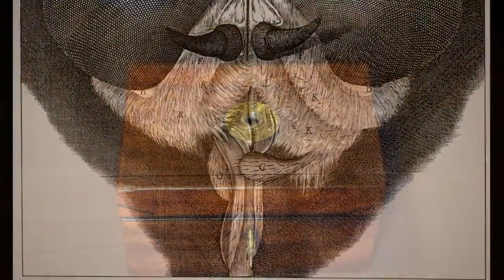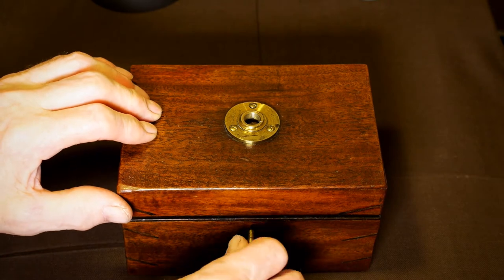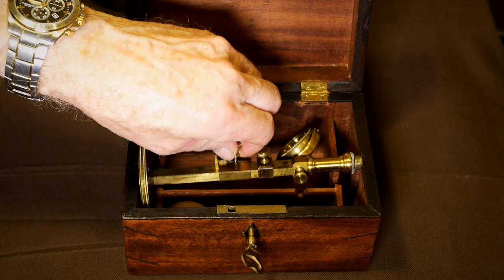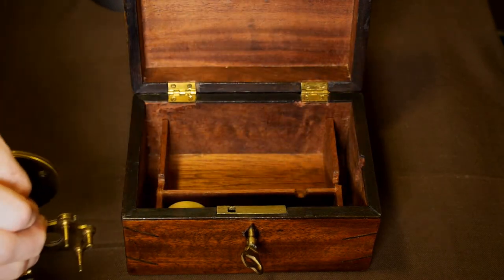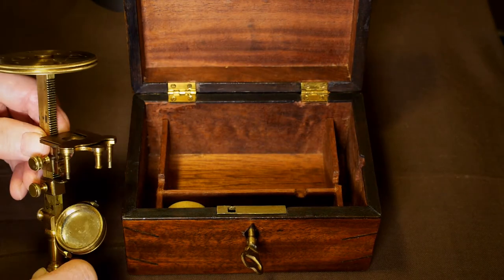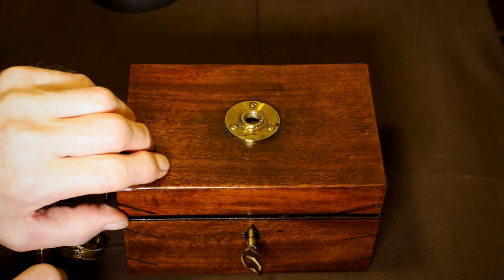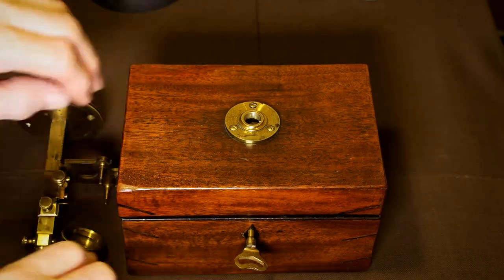So let's try and put ourselves in their shoes as it were, and take a look through one of those early 18th century simple microscopes. The one I've chosen is this extremely rare instrument made circa 1785 by Thomas Fuller, an apprentice watch and clockmaker from the city of Norwich, Norfolk in the UK.